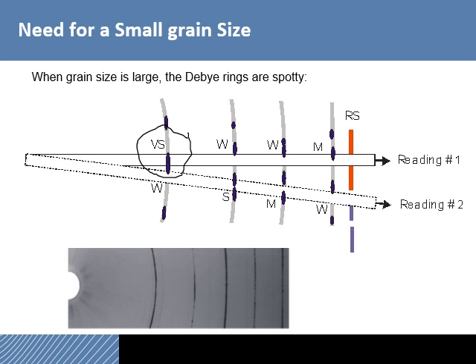So this would be an example of a peak that would be very strong. As we go down, pardon my drawing, in this position you didn't have a particle diffracting, so it would be weak, which is what the W is. We keep going, weak. And here it's partially blocked, so you'll get a moderate intensity peak.